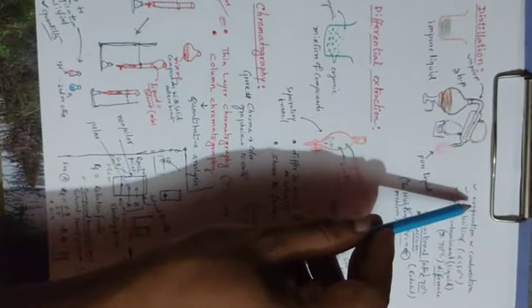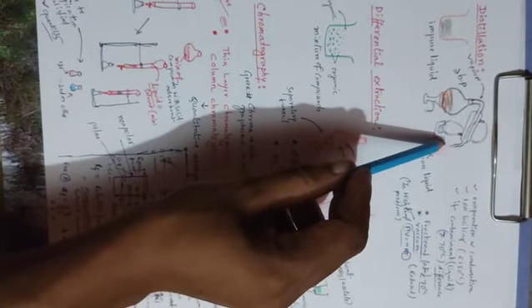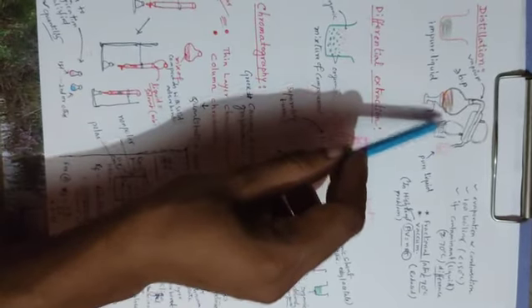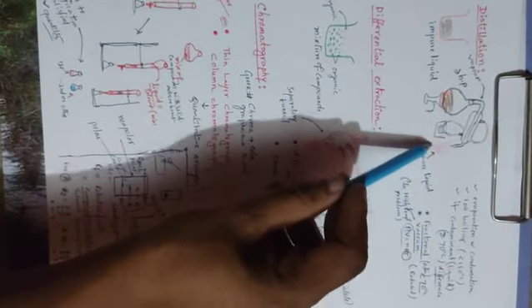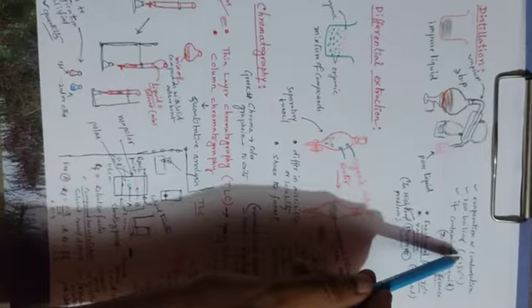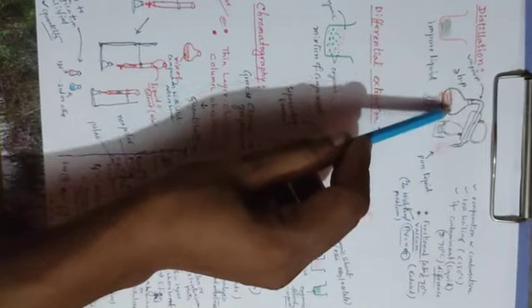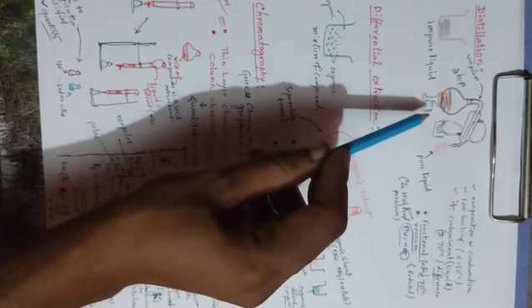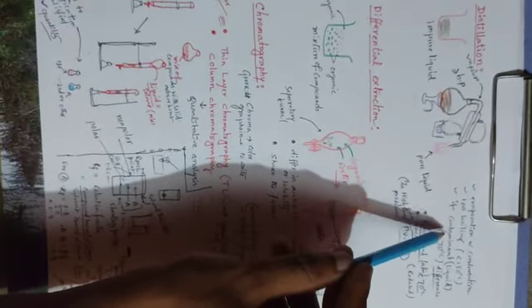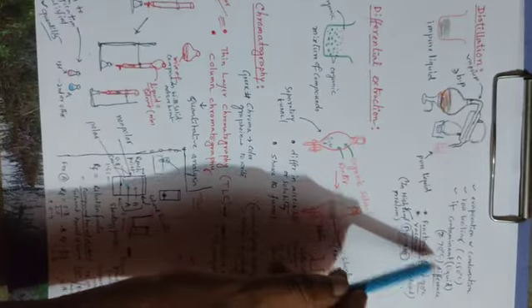So here the main basic part is evaporation followed by condensation. This process is generally valid when the main liquid component has a low boiling point, less than 150 degrees centigrade. And if the main liquid is contaminated with another liquid, and we want to separate them by distillation, they should have a difference in boiling point of at least 70 degrees centigrade.